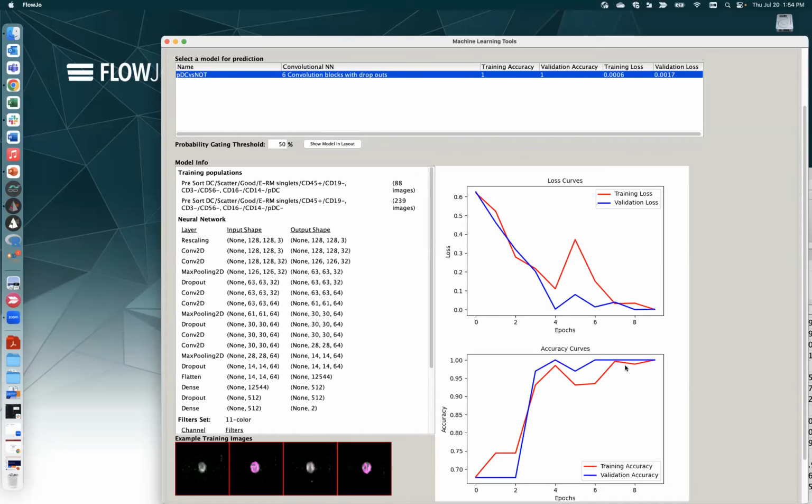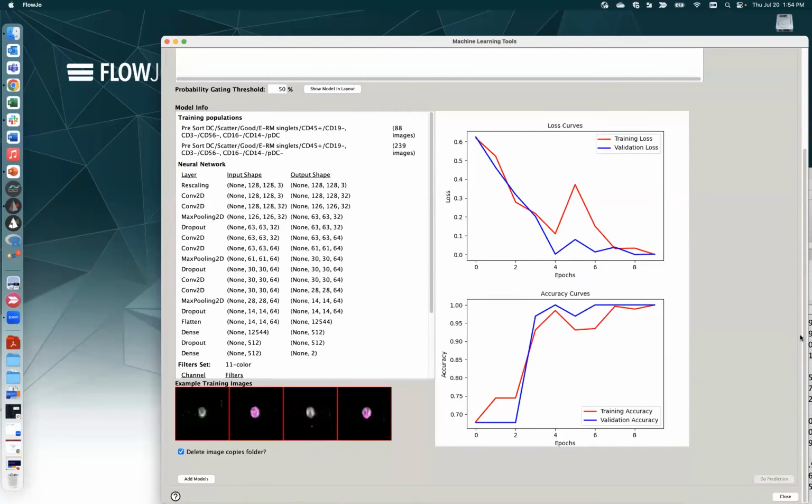On the training data, we actually are fairly happy that it wasn't perfect the whole way. The validation one was perfect. We weren't overfitting, perhaps. You can see that there were definitely some interesting epochs in there, and that the training loss got pretty rough. Interesting, the validation loss was already better. And then nicely, we can see the images that it said, okay, here's our example of our training images. Okay, so we brought some nice bright pink ones in.